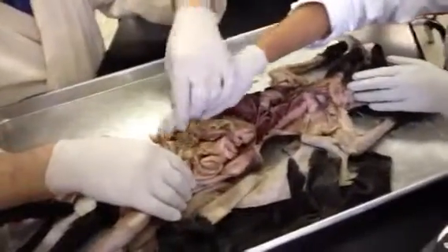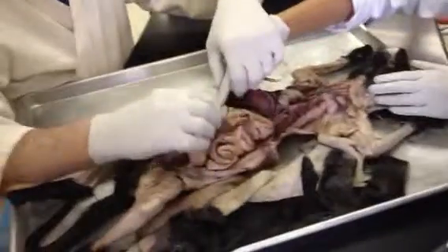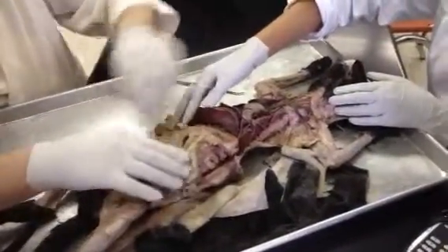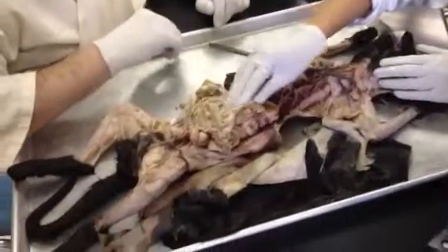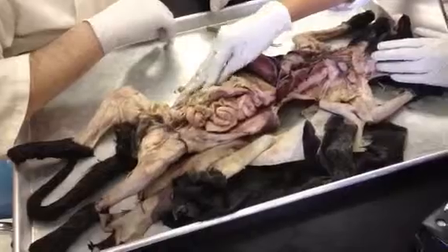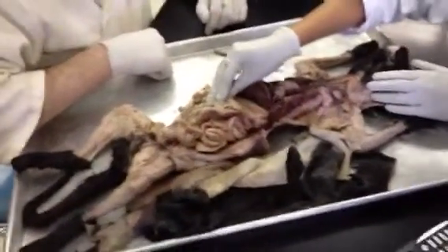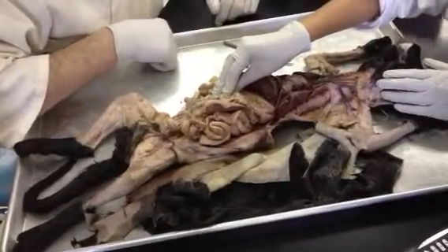Okay, let go of it. This is all intestinal tract. All this stuff down here is intestine. And this sheet, let me put it back the way it belongs, and you can feel how it overlies the rest of the intestinal tract. That's what we call the greater omentum. It comes off the greater curvature of the stomach, and it covers the intestine.